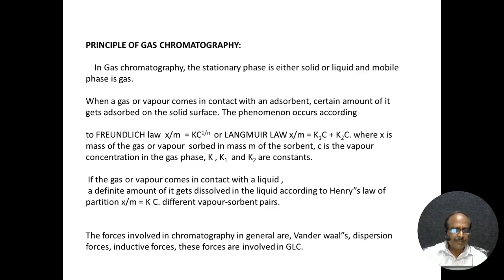What is the basic principle involved in gas chromatography? In gas chromatography, the stationary phase is either solid or liquid, and the mobile phase is gas. The mobile phase is the gas, that's why it is called gas chromatography. The stationary phase is either solid or liquid.